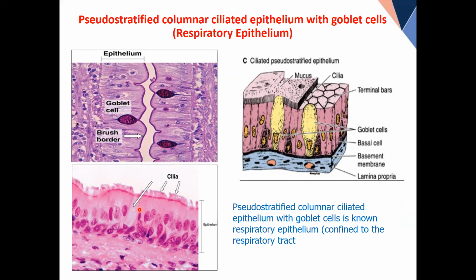Somebody asked me, Dr. Zafar, are we supposed to know, memorize, remember all these photomicrographs? So the general answer is, we use these micrographs to confirm whatever text is written there. These slides are for your practice. I cannot explain without showing. So whatever I am explaining, you can confirm it by looking at the slide. You have to be careful.